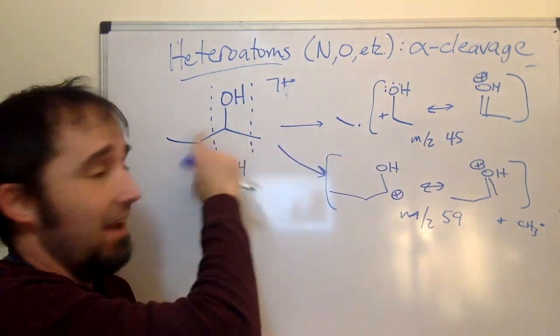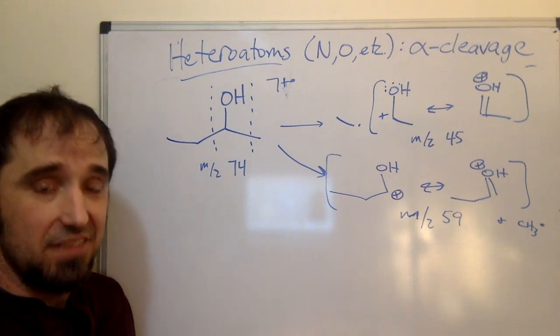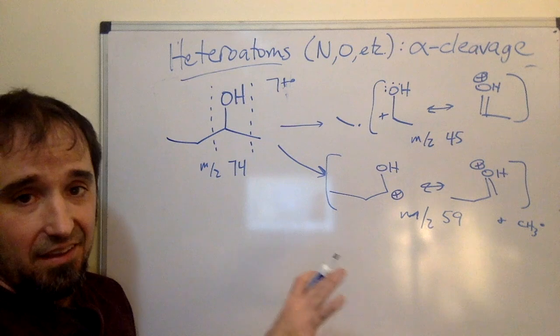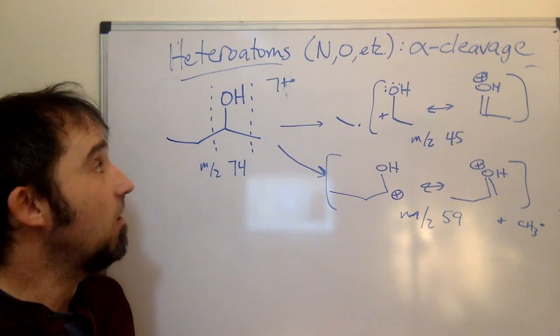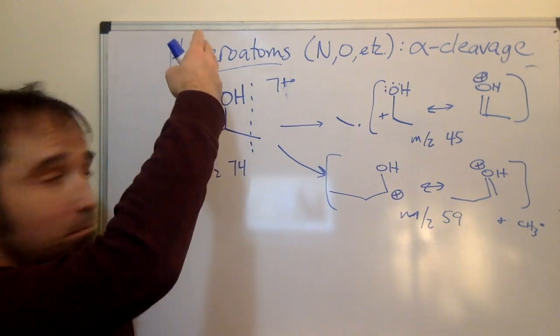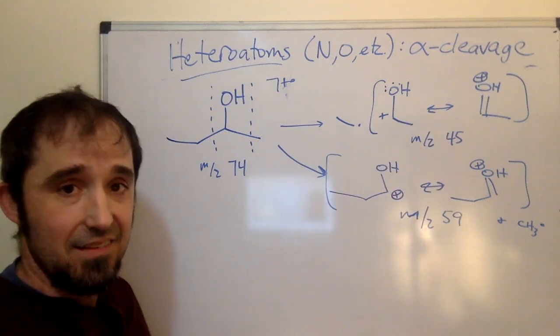On both sides of that. So we learned earlier that lone pairs can help stabilize cations. So this is a consequence of that: when I take the mass spectrum of an alcohol like this, I'll be able to chop on another side and see stabilized cations like that.